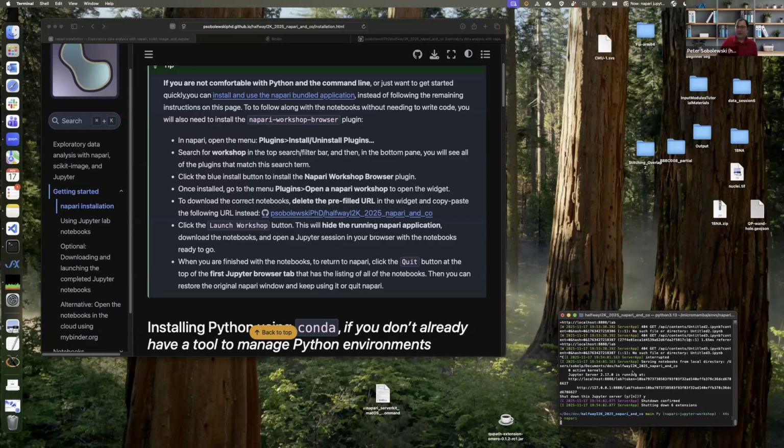This launch time for Napari is not representative. I'm on my work laptop, which has a whole bunch of security software, and every binary gets scanned and the code gets analyzed. And so, unfortunately, this security software makes it very slow to interact with things that are not in a web browser, which is one of the reasons that I'm going to be showing you how to use Jupyter.